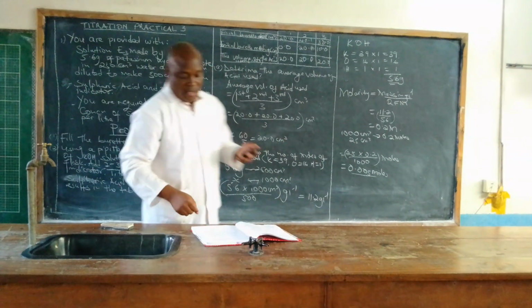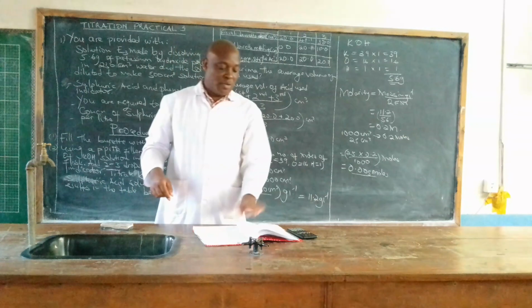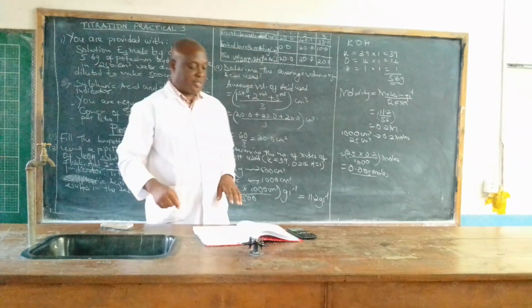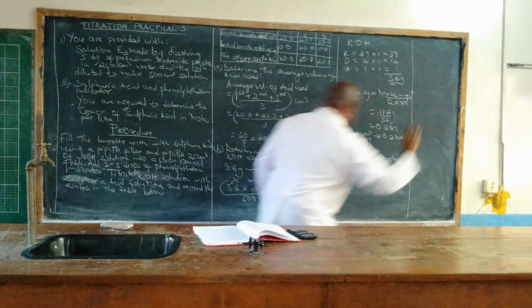Okay. So after that, now we are going to determine the number of moles of sulfuric acid used. We are supposed also to economize space like that.